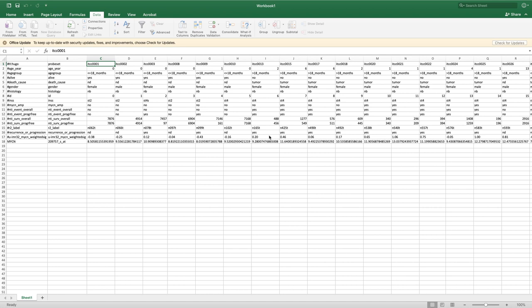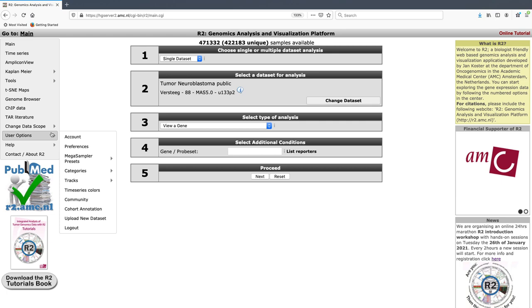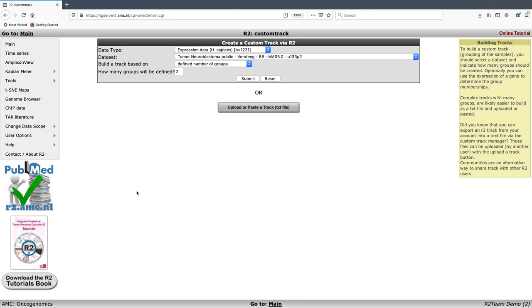One example would be if you wanted to create your own track using your own sample annotation within R2. Switching back to R2, you can see here in the left tab that under User Options and under Tracks you have the option to build your own custom track. Clicking on that, you can see there are different options for how you would like to build a track - you can use data currently present in R2, defining different numbers of groups, or there is also an option for uploading or pasting your own track as a text file.